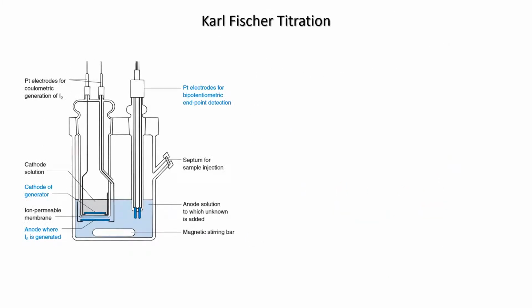The Karl-Fischer titration is a widely employed method for quantifying trace amounts of water in samples of oil, food, solvents, polymers, and a range of other possible materials. On a larger scale, greater than 1 milligram water content, the titration can be performed volumetrically. For smaller amounts of water, the coulometric method, for which the apparatus is shown here, is preferred.